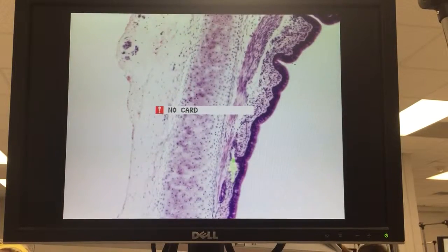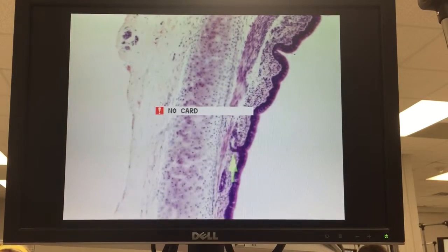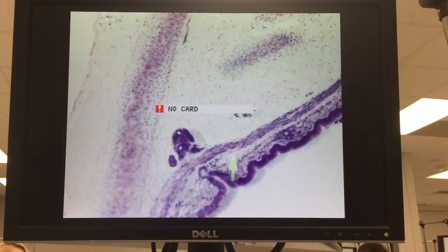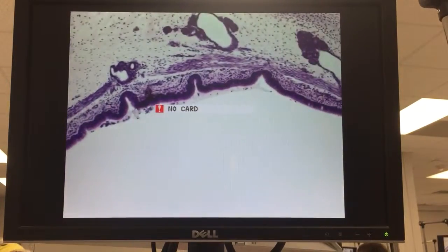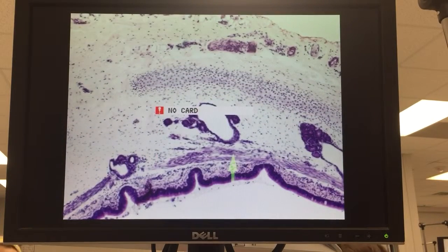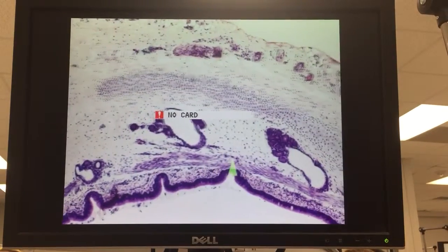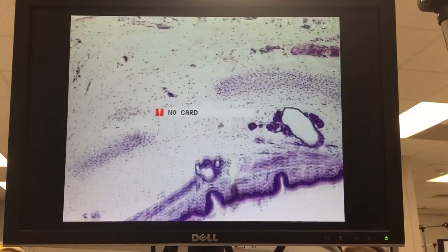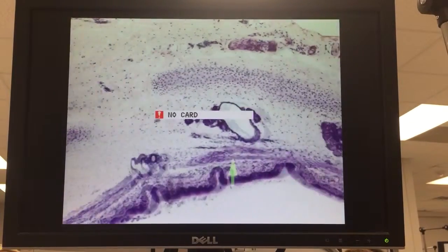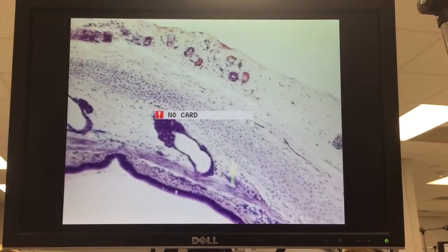You can see some submucosal glands, ducts coming up to the surface there, and as we come to the posterior portion of the trachea, there is the trachealis muscle — smooth muscle — joining the two ends of the cartilage. Now sometimes you can find them going right from the end of the cartilage, other times they'll be attaching towards the interior surface.